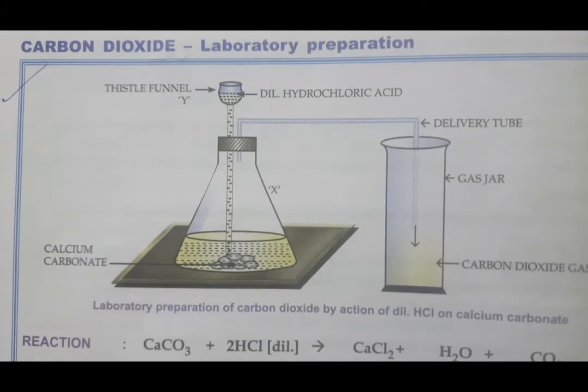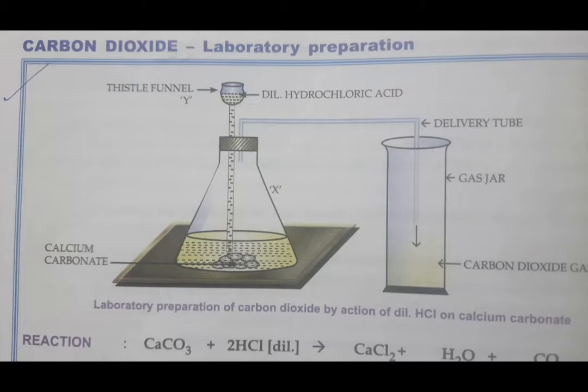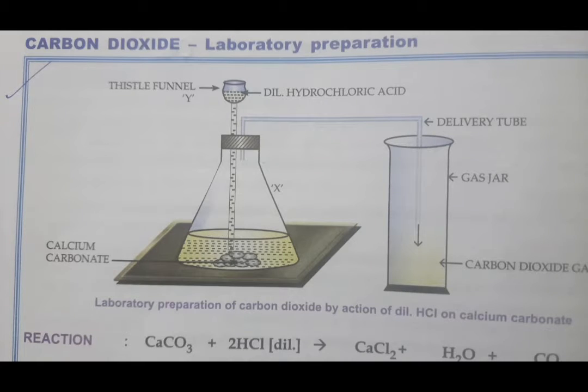Students, in today's video we are going to see the laboratory preparation of carbon dioxide. It is very important for you all to remember that last time we did the general preparation of carbon dioxide, for which I explained some reactions to you. Do practice those reactions the way I have taught you. Now we are going to see the laboratory preparation of carbon dioxide, students.